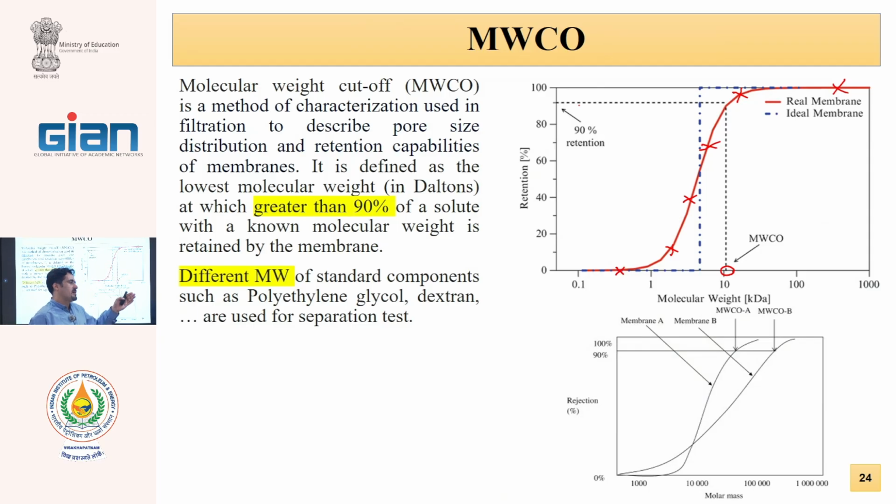Say I have a UF with molecular weight cutoff of 50,000, 100,000, 200,000, and this molecular weight cutoff is showing the pore size of the membrane, and it is more real than the other processes that yesterday I discussed. This is a real test. You test with a solution and obtain this data, and this is very real.